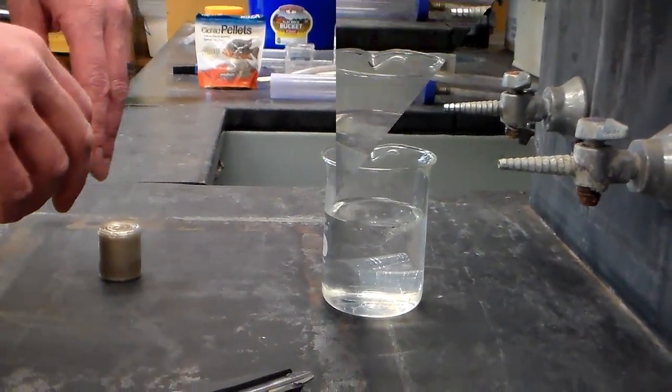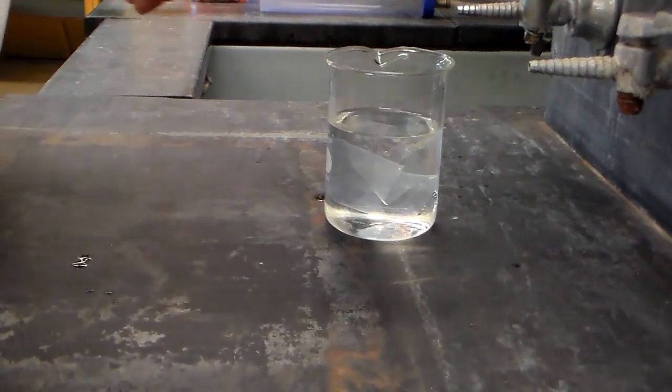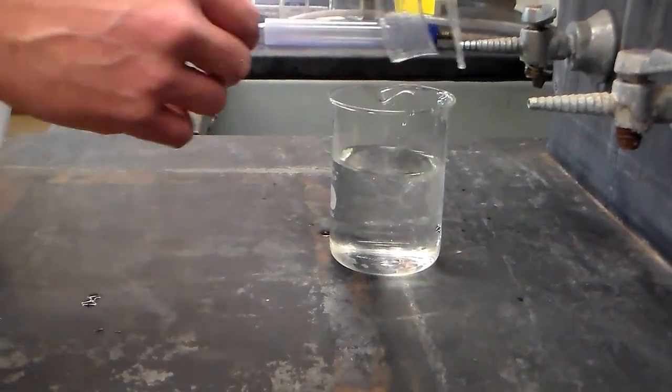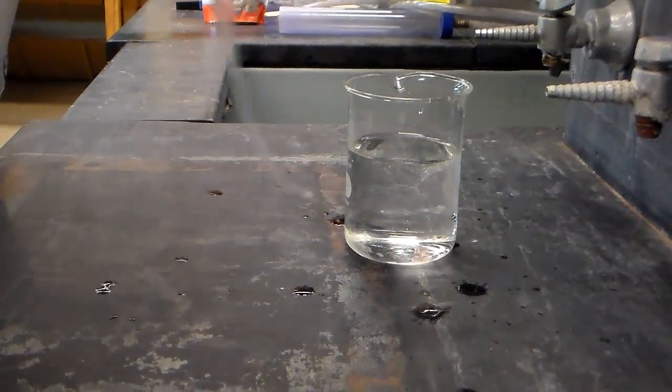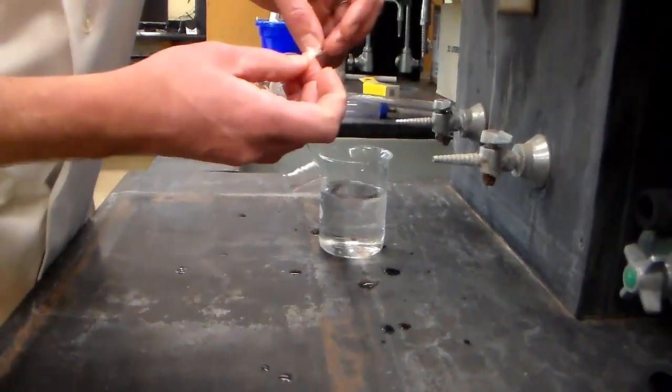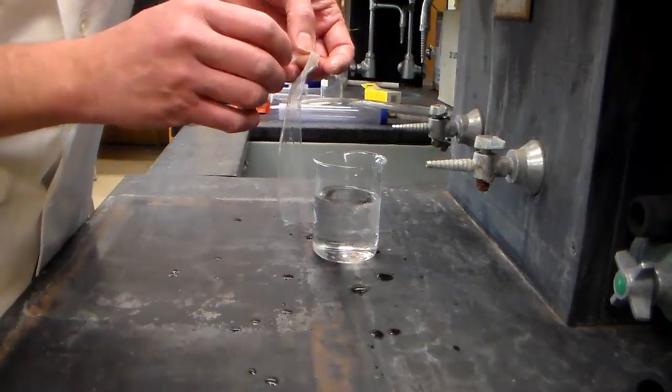Okay, so the tubing has been soaking for a while. You see it's much more pliable, so we want to take one end, bunch it up, and very carefully tie a knot in the end.